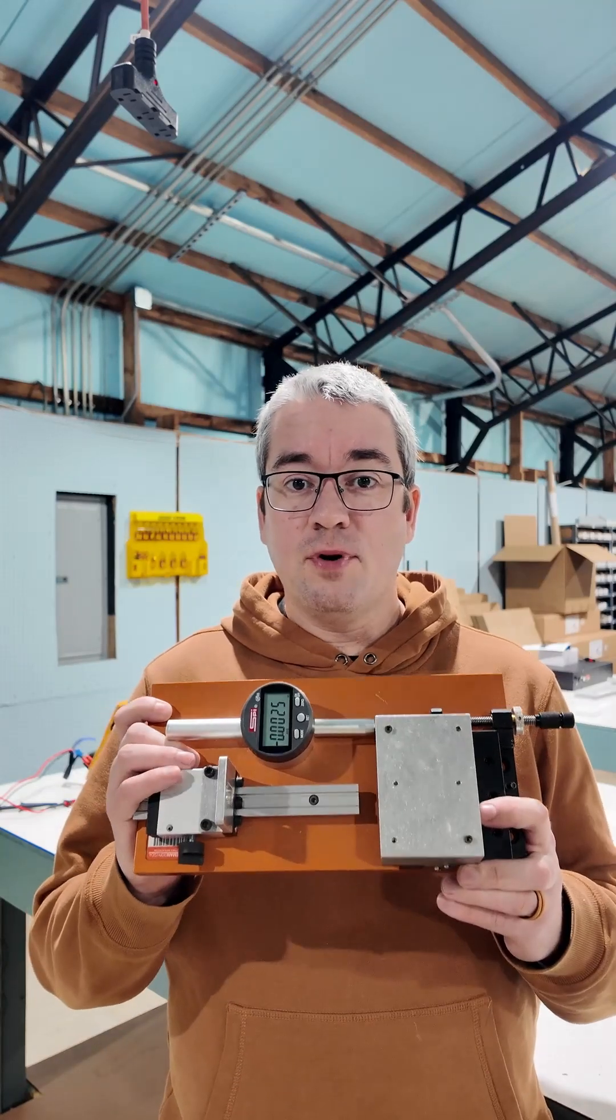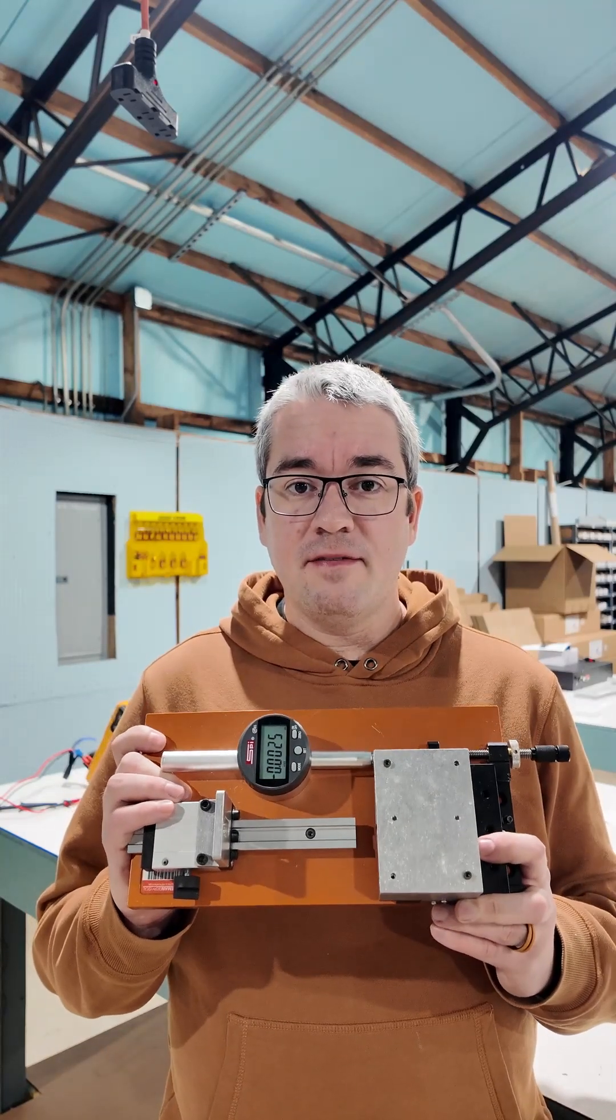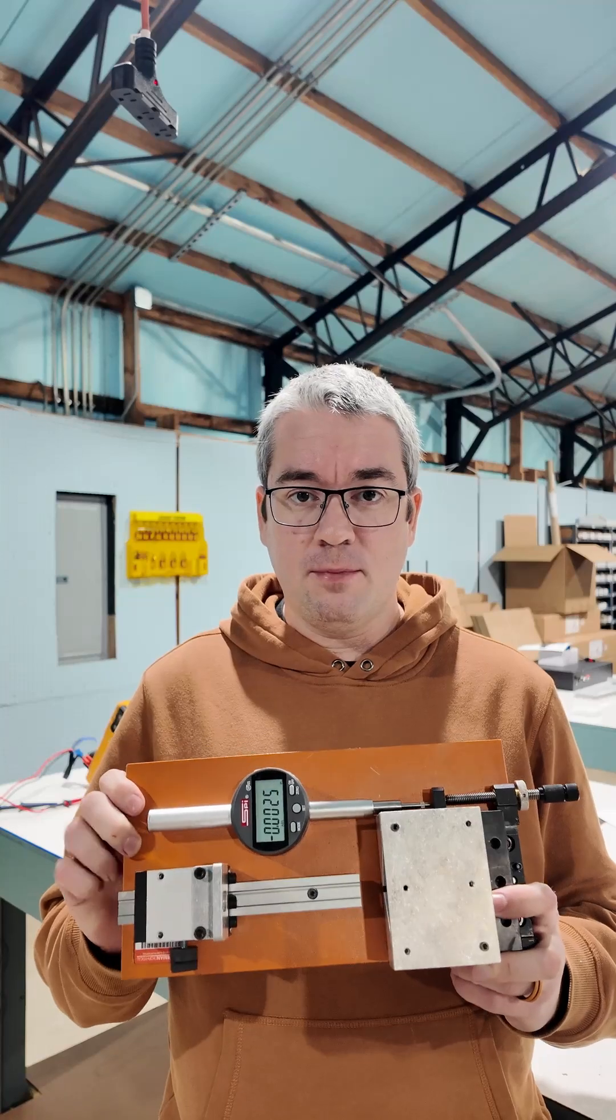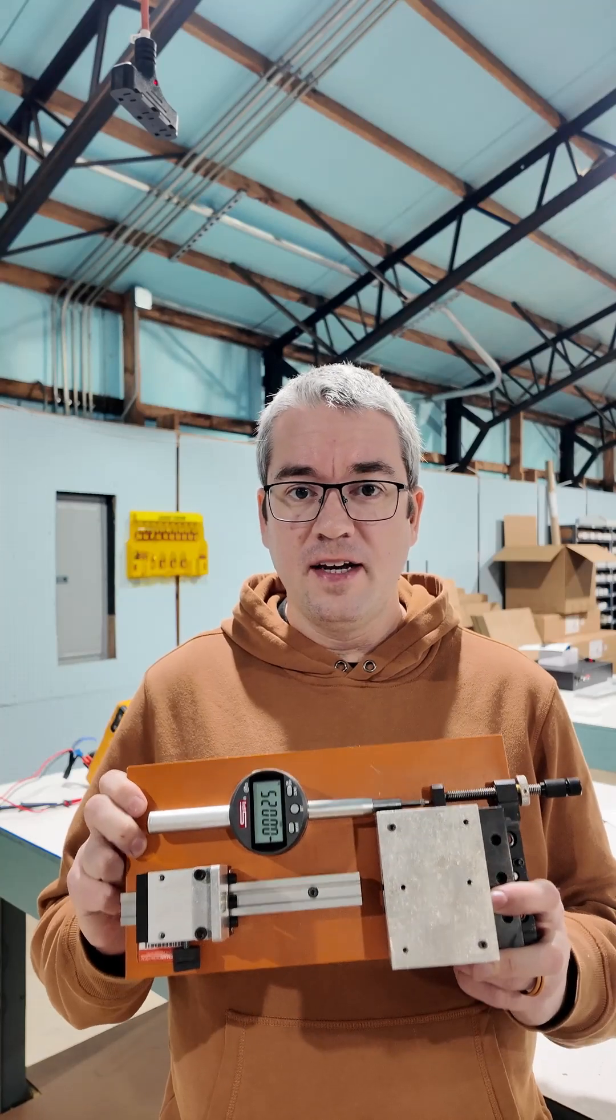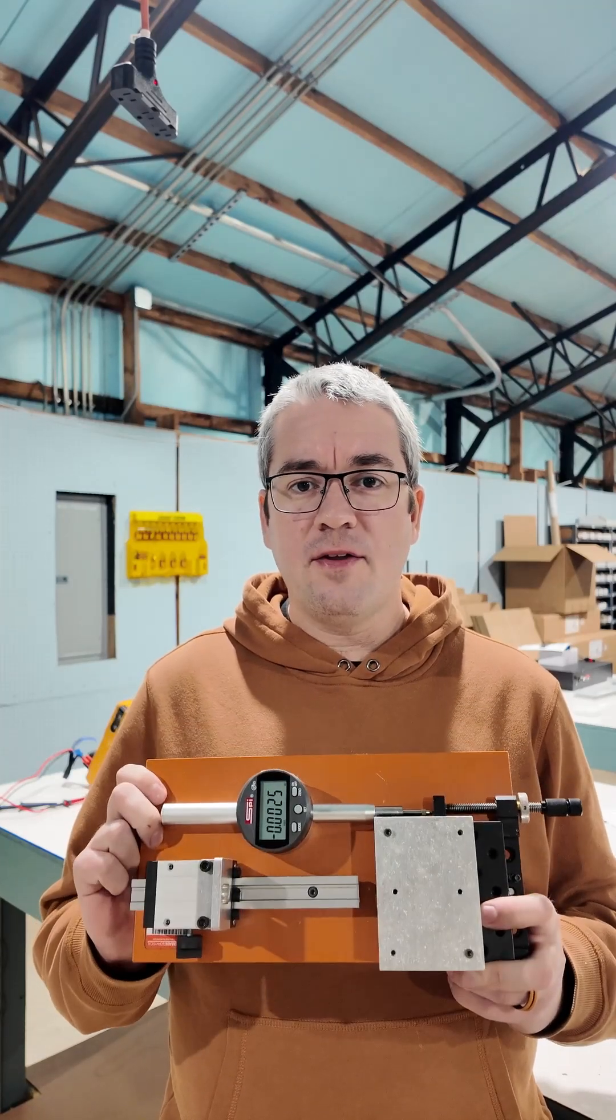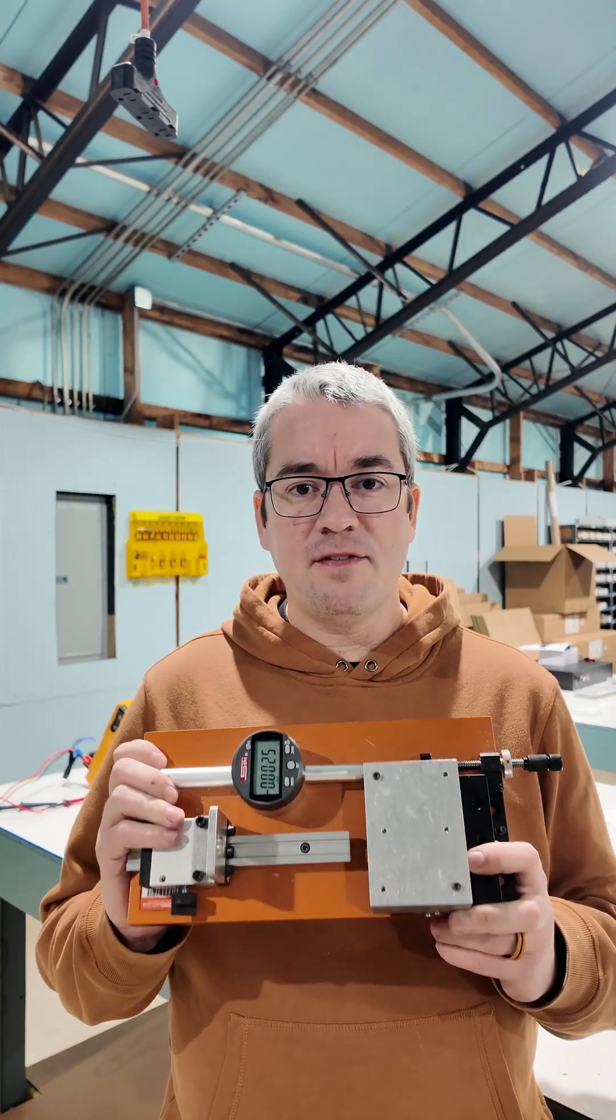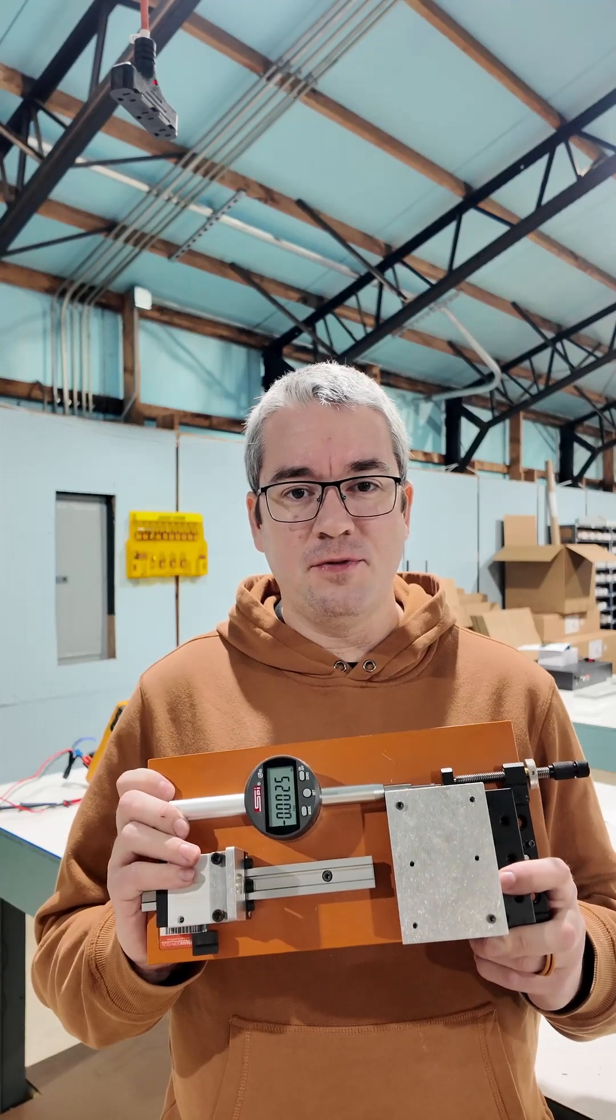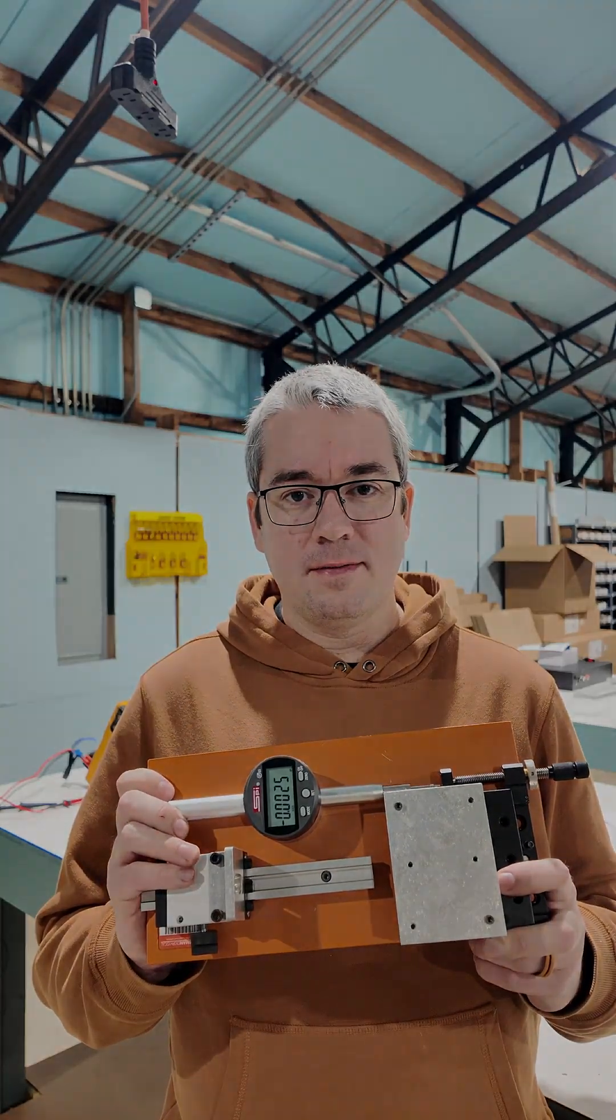Do you want to see a secret? This is the prototype of the updated version of our displacement transducer calibration apparatus. This is in use in labs around the world, but we've made a few improvements and I want to show you those before they're released.